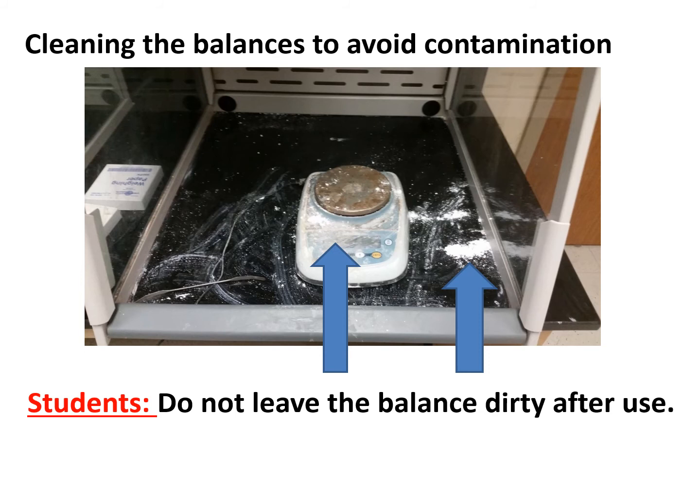So we can't have this. You can't leave it dirty after use. If you're weighing something out and you spill it, stop what you're doing, clean it up then, period. Fix the problem as it goes.